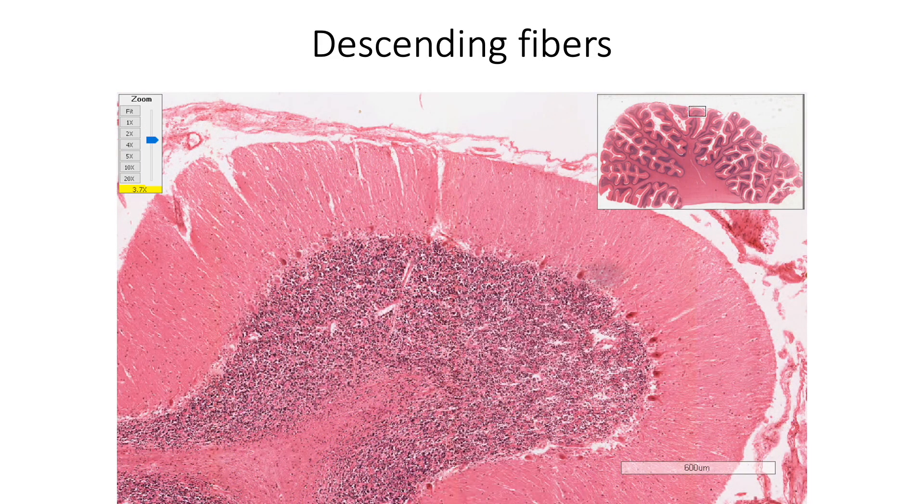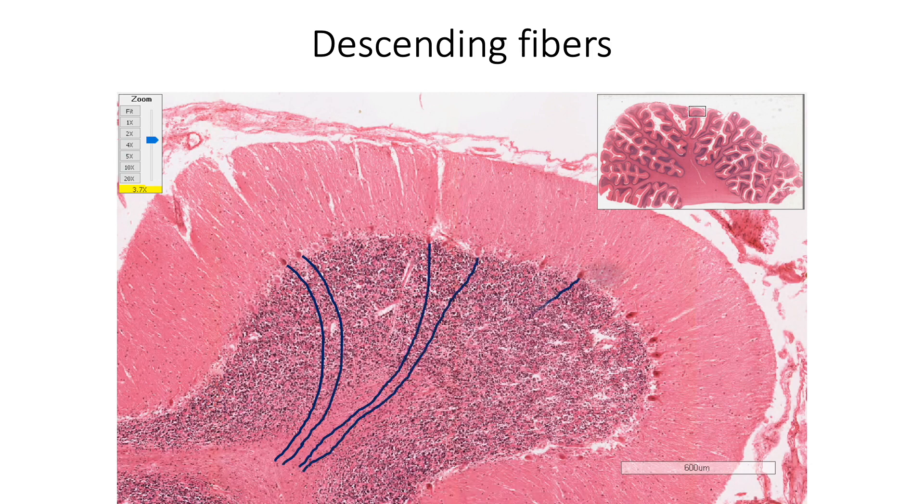Descending fibers in the white matter are the axons of Purkinje cells which are the only cells carrying output signal from cortex. Most of these terminate in the intracerebellar nuclei whereas, few fibers terminate directly in the vestibular nuclei.